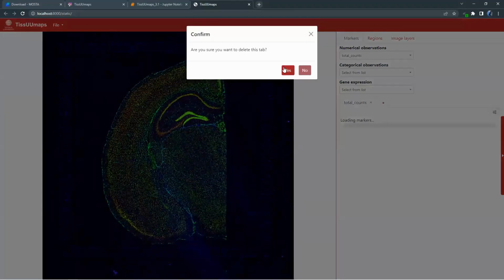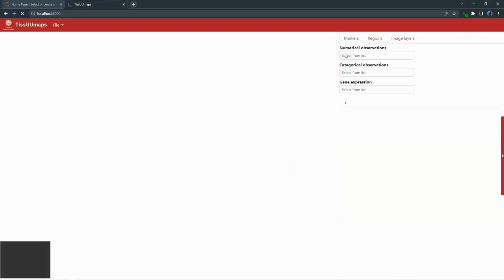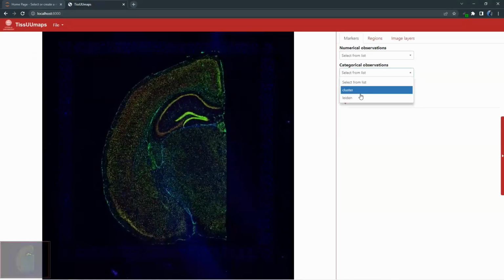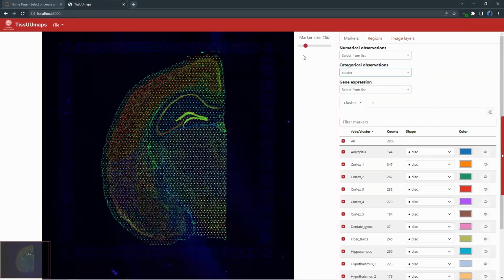Well, we should be able to. Let's check. We have to restart my server here. If you give me one second. Yes. So now if I go back to the server here, I directly have that, and now it's loading.